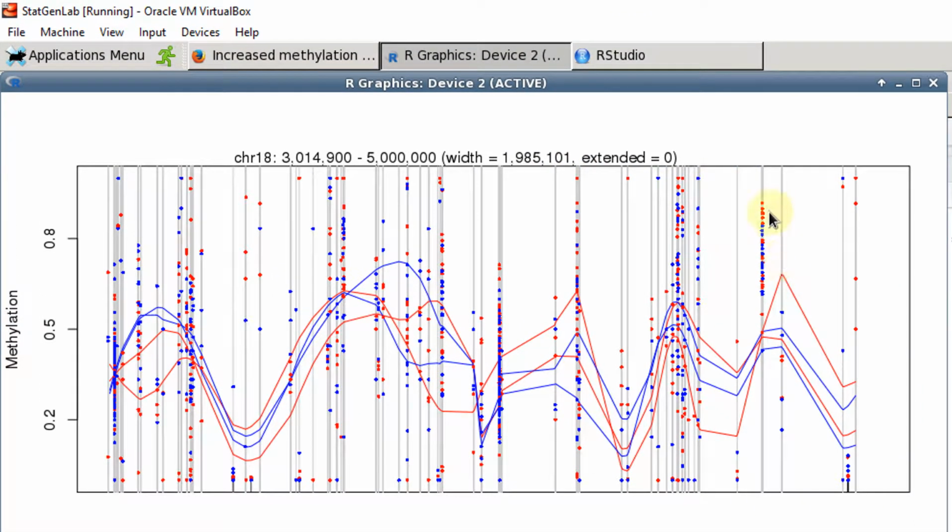And then all the points along, and some of them are actually dense gray lines on top of each other, which is why there's more than 4 points in a lot of places. And recall that this is RRBS data, so it is going to be a little bit chunky. There are CpGs here, there are CpGs here, but then there are these big white spaces we didn't include. There are just kind of holes in the genome. And so you end up with a lot of CpG sites in these CpG-rich regions, which is why you see more than 4 points per line. You see a lot of them clustered.